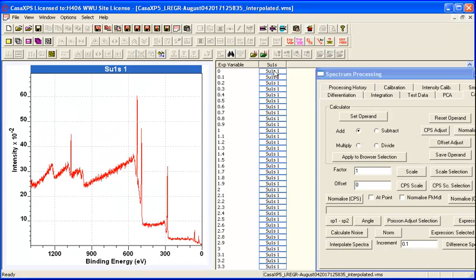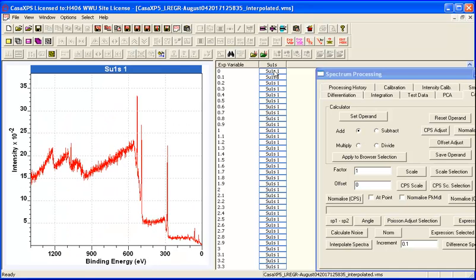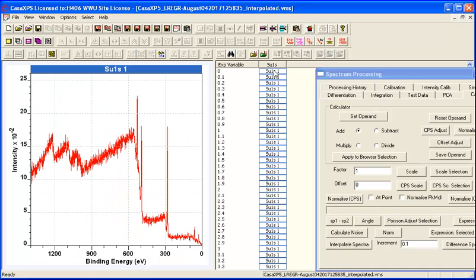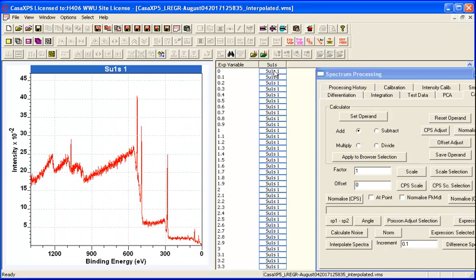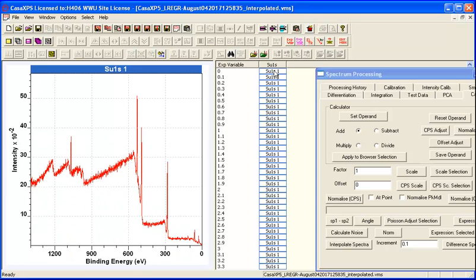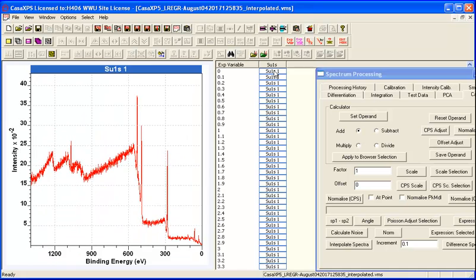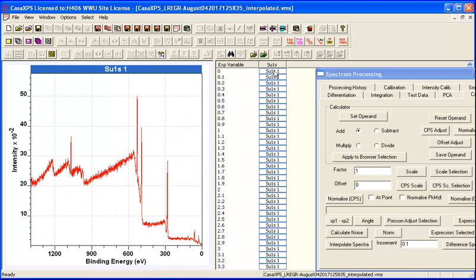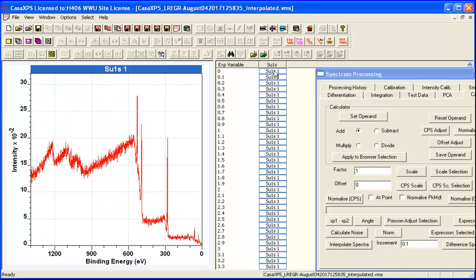Now ideally you would like to have 26 spectra against which you would measure, you would reproduce using these different shapes, and that would give you confidence that you had chosen wisely and that these were in some way component spectra that represented the entire set of measurements that you performed. So let us again go through here and try and choose.